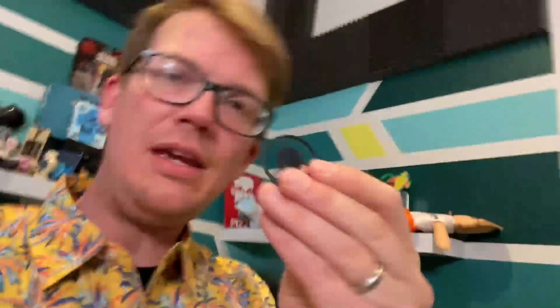There are basically two kinds of filters here. These are your dark field filters. In bright field, all of the light comes through the sample. These block the light coming directly from the bottom of the sample, but they allow light to go through the organisms on the sample without going through the bottom, so that the organism appears to be on a dark background, which is really pretty.